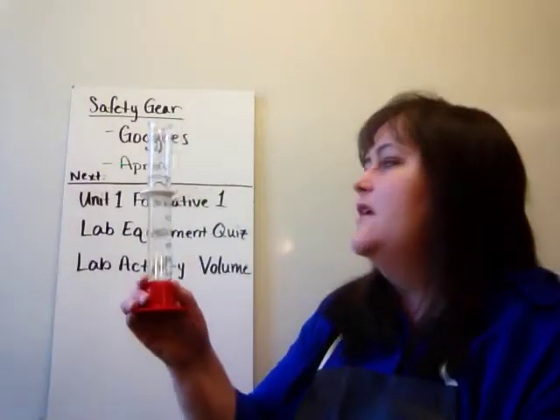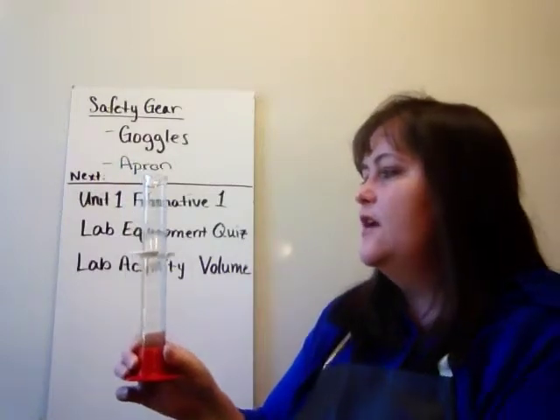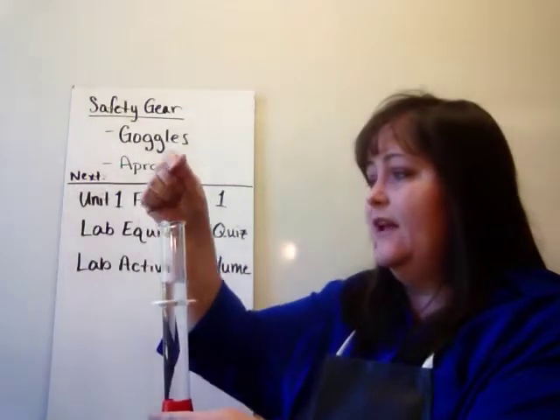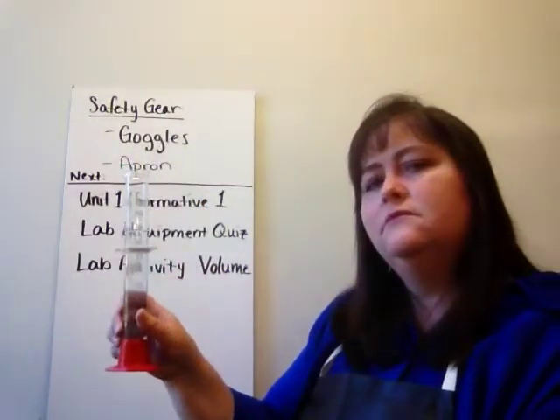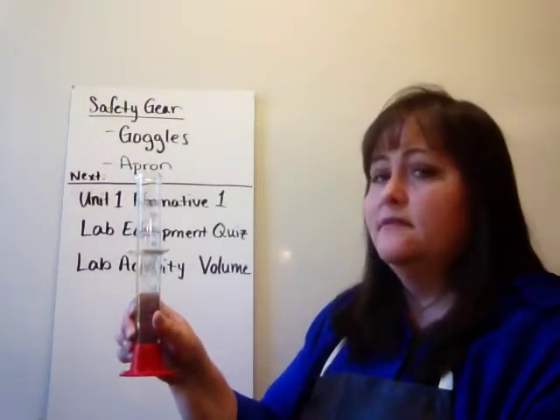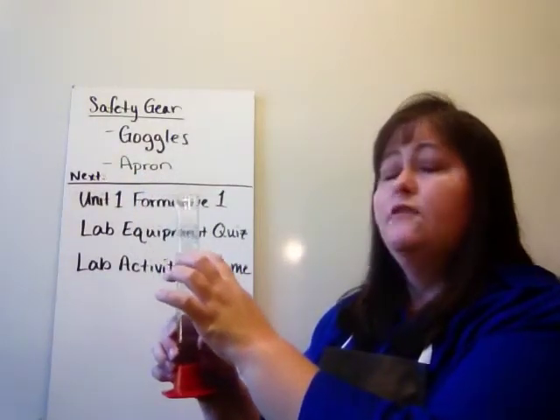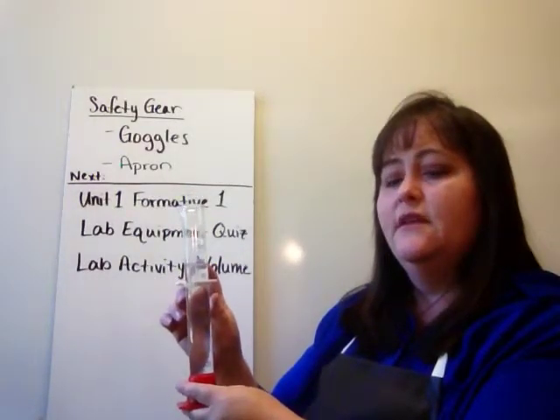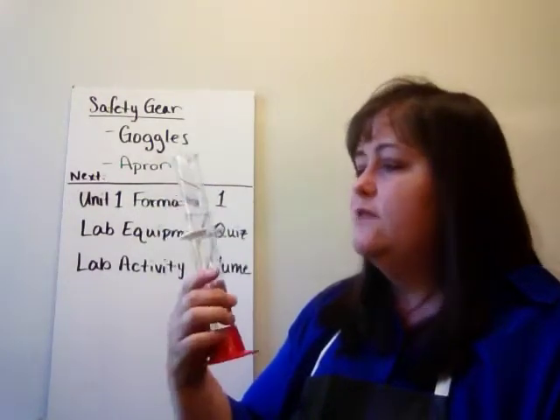So what will you do? You'll take a volume of water in the graduated cylinder. You will attach the object to a string and drop it into the graduated cylinder. Now what will happen to the water when you drop that object in? It'll go up, right? So when it goes up, you'll measure the new volume, and then you'll compare the first volume to the new volume. When you compare them, you'll subtract. Once you subtract, you've got the volume of the object.